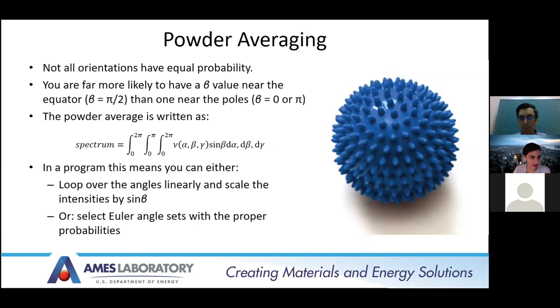And then someone else asked, what is gamma compute? Gamma compute is a particular scheme that was developed, I think, by Matthias Eden for speeding up calculations where your propagator is repetitive. So I'm not going to go over this. This is something that you'd have to program yourself. You'd be interested. I've never programmed it myself, to be honest. And someone else asked, how does one define limits in interpolative powder averaging?